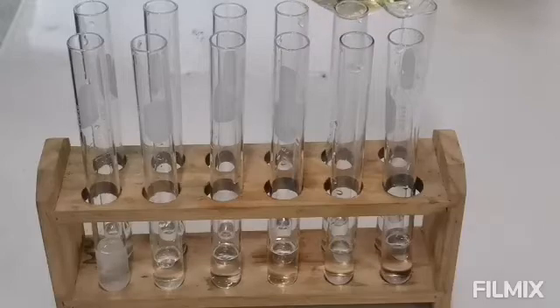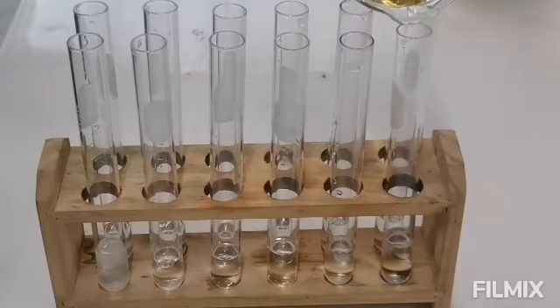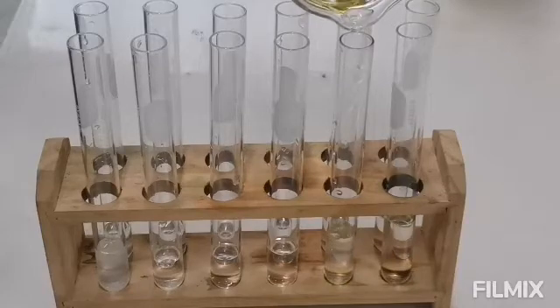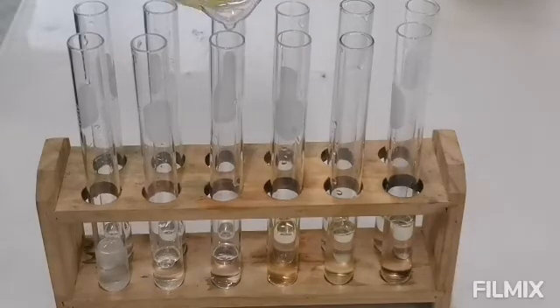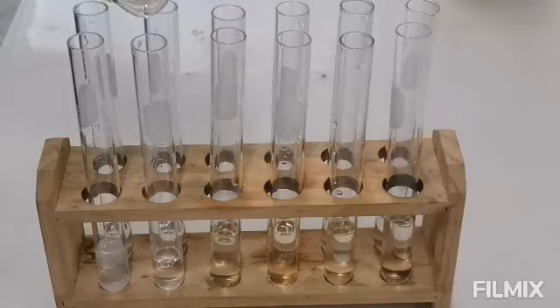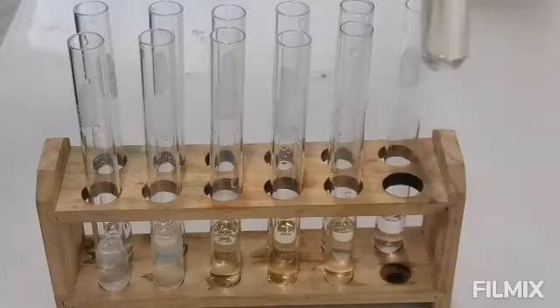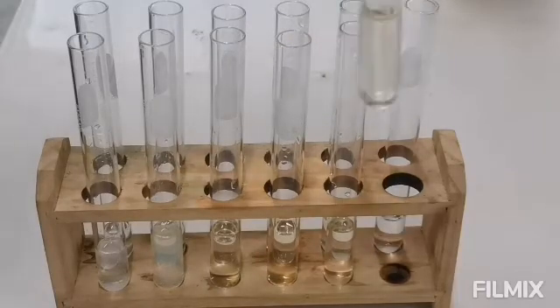So I am now adding a little of albumin to the first test tube, and then to the second test tube, and then to the third test tube, and to the fourth test tube, and then the last test tube. Okay, that is the beef extract. Let us try to observe some possible reactions that you could see.